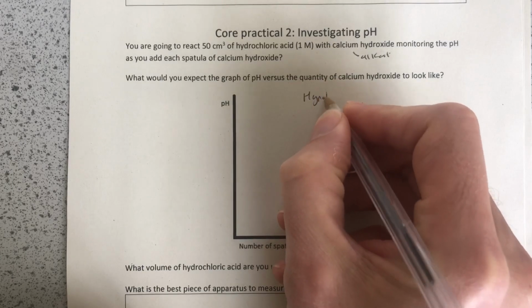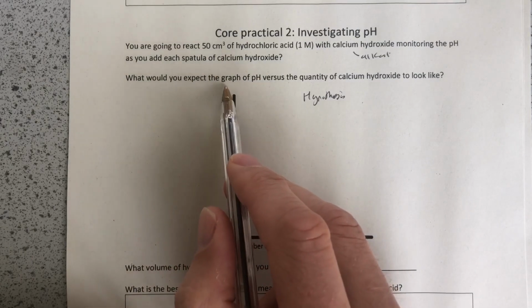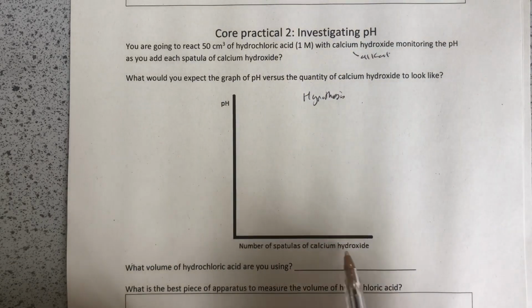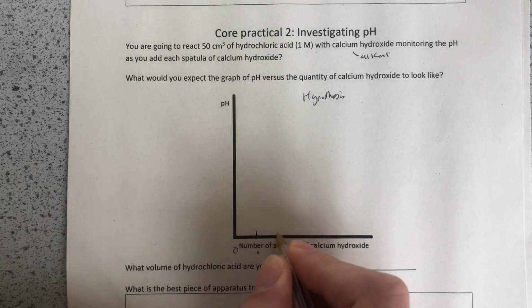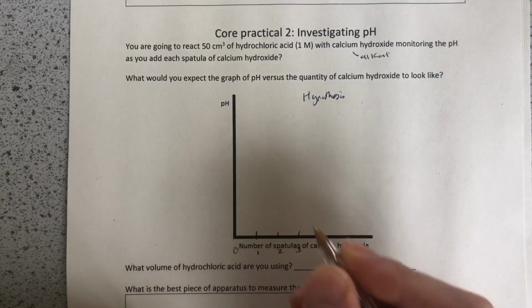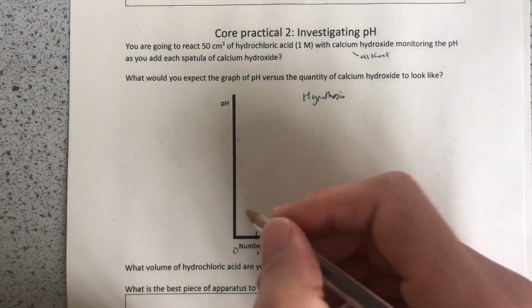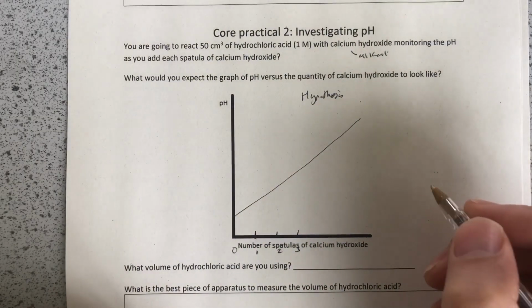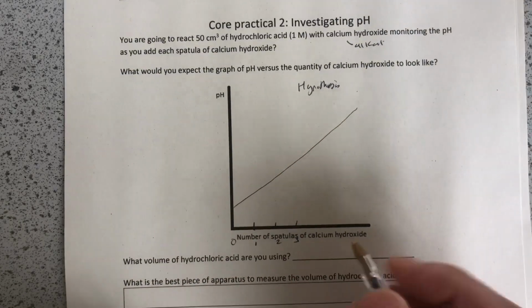So we've just got a prediction here. This is a hypothesis. Okay, so this is not what is going to happen. This is maybe what we think will happen. What would we expect the graph of the pH versus the quantity of calcium hydroxide to look like? So on this axis here, we have the number of spatulas added, so that would be 0 spatulas here, then 1 spatula there, and 2 spatulas there, and 3 spatulas there. What will happen to the pH of the acid as we add those spatulas? Now, when I ask classes that, they tell me they can expect the pH to rise a little bit at a time, okay? And probably in a straight line arrangement. So, let's see if that's what happens.